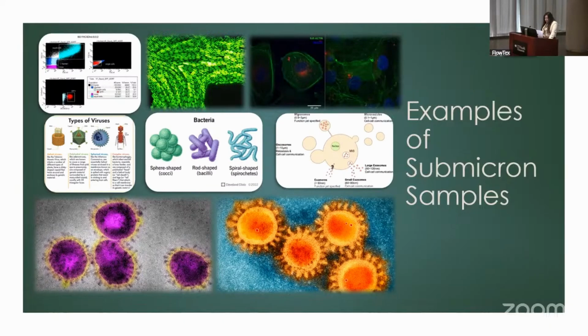So anyway, you can see that things don't look so different from any other sort that you would do on a regular day on any other samples in DIVA. That's because I obviously didn't invent submicron sorting, single cell, single virus, single vesicle sorting. It's all the same technology. It's nothing new. So it's just really a matter of optimizing the protocols and procedures for specific applications and instruments, plus actually being willing to accept and do the experiments in the SRL.